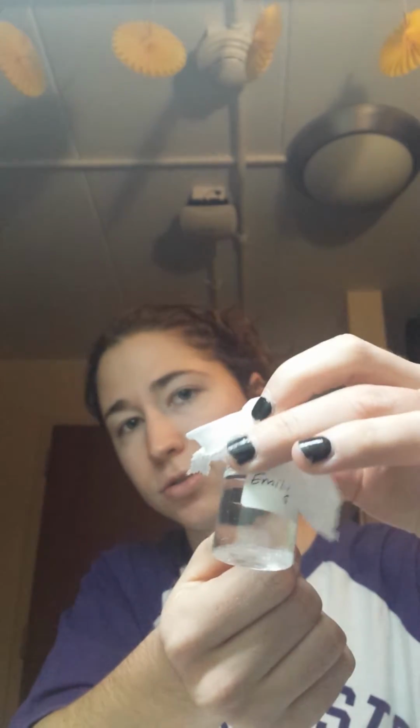So I have one large crystal, but there could be many ways to expedite the process and have a method to make one large crystal in the middle. I think if you put a lid on top of the bottle with a string hanging down into the middle of the solution, that would provide a seed, somewhere for the solution to latch onto when it comes out and make a bigger crystal there.